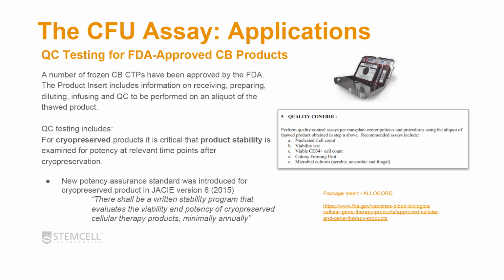And that insert, and inserts for all of the cord blood cell therapy products that I've seen, include very detailed information on how to receive the product, how to prepare the product, how to dilute the product, as well as how to infuse it and ensure that you actually maintain a sample that you can do QC on so that you can confirm that the product that you have has not been affected from the transport from the cord blood lab to the clinical site.